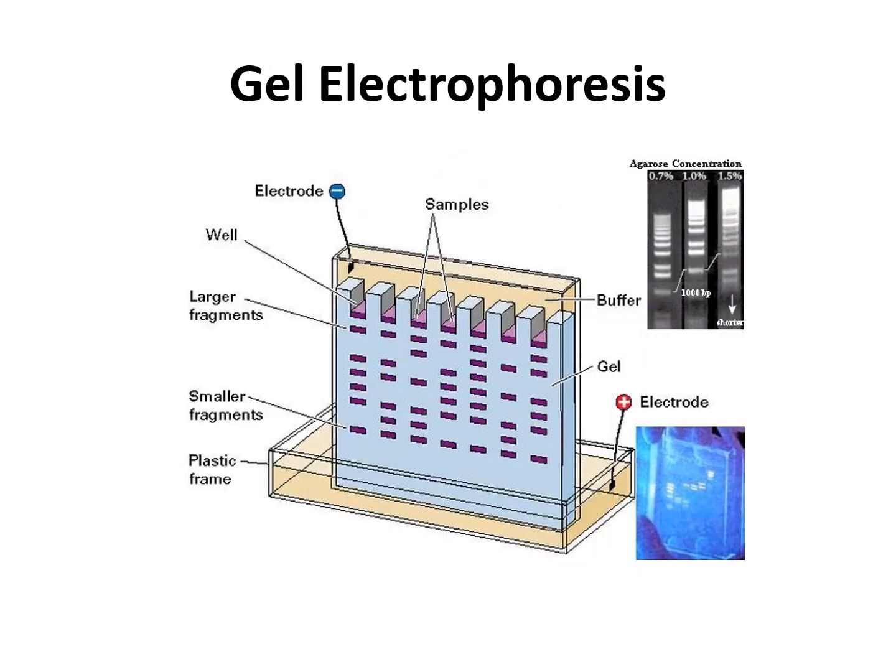Another biotech technique is gel electrophoresis, and gel electrophoresis is used to separate DNA by size. So if you have a sample of DNA that has fragments in it of different lengths, you would load that sample into a well in the gel, so this is the agarose gel.